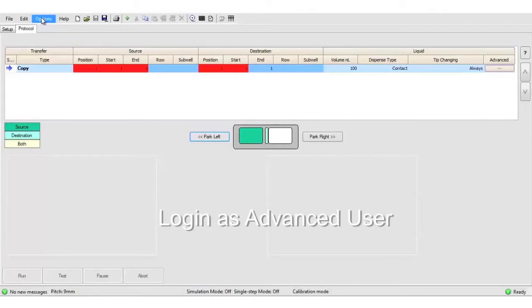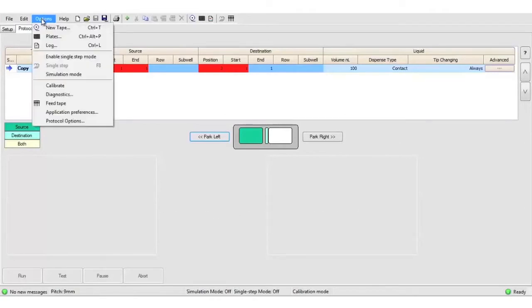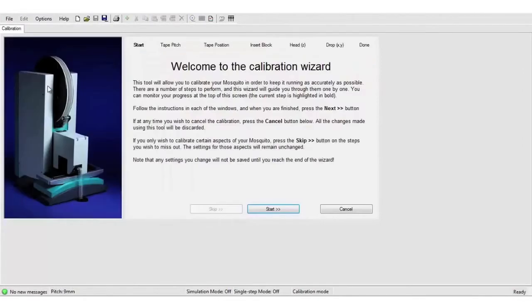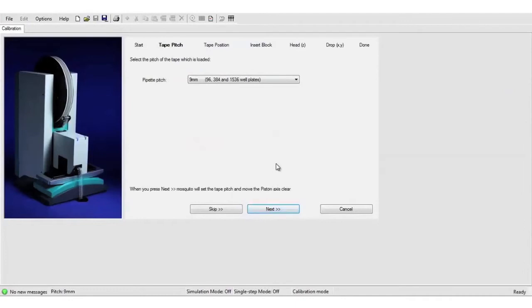To open the calibration wizard, we go to options, calibrate. Now there's a step-by-step guide of how to calibrate. Choose the pitch of tape we're actually using, which is 9mm, and click next.